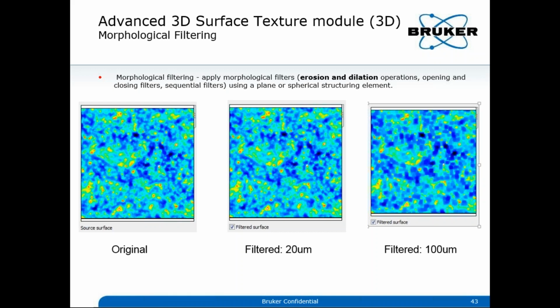So this is probably a very good feature for comparing the stylus and also the 3D optical measurement data. A lot of manufacturers are using a 2D method, like a probe to scan a surface.